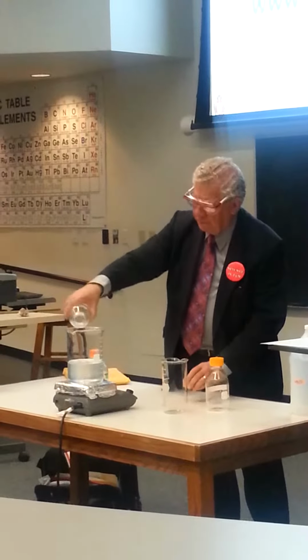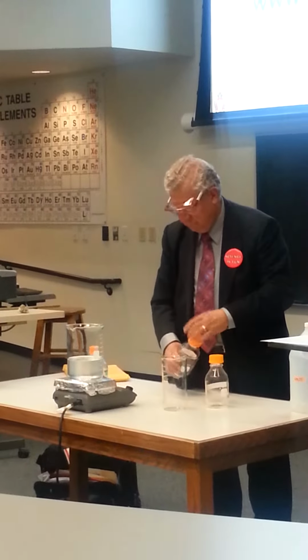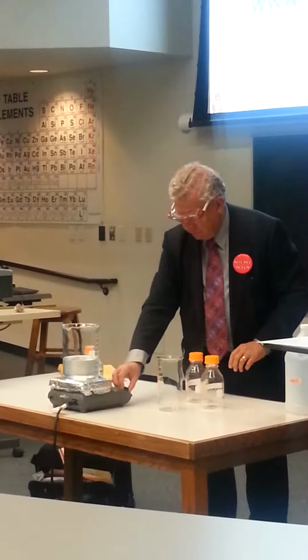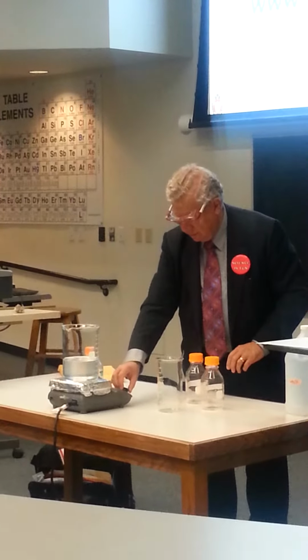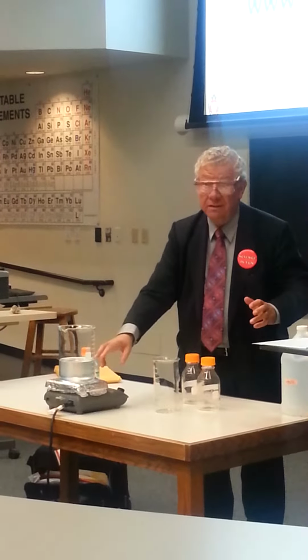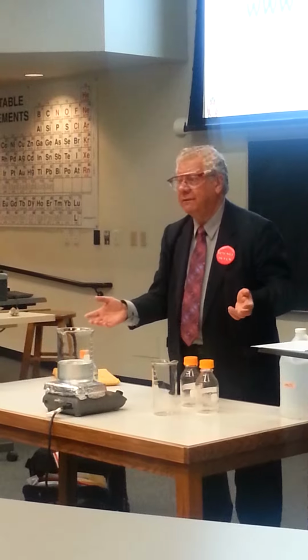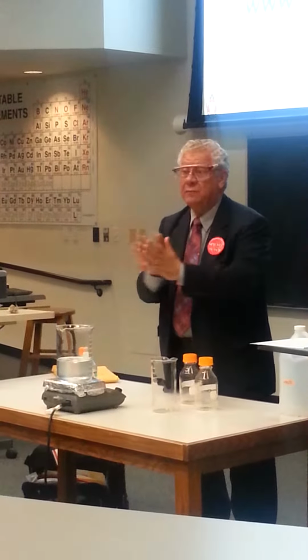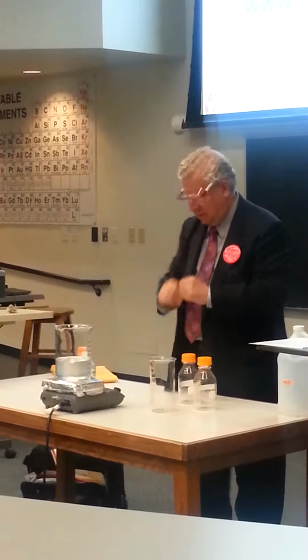Anything interesting happen so far? Sort of cloudy. Getting cloudy. Liquid is getting cloudy. And you can see now by increasing the turning, maybe you can see the vortex a little bit. And you can see the volume has increased. You know, that's not very interesting, right? That's kind of expected. But it's not really expected every time you mix 2 liquids together, right? There are other forces that are involved there.